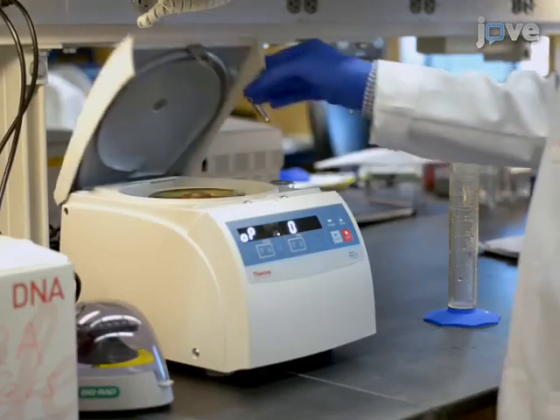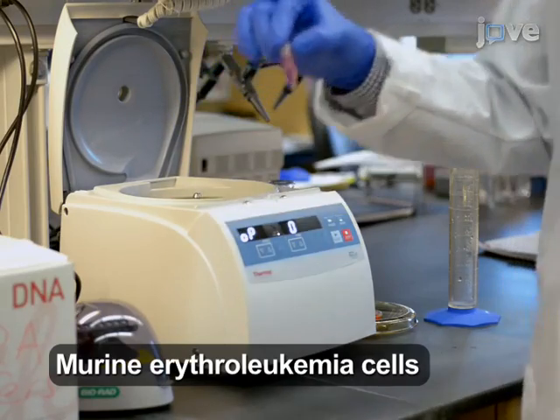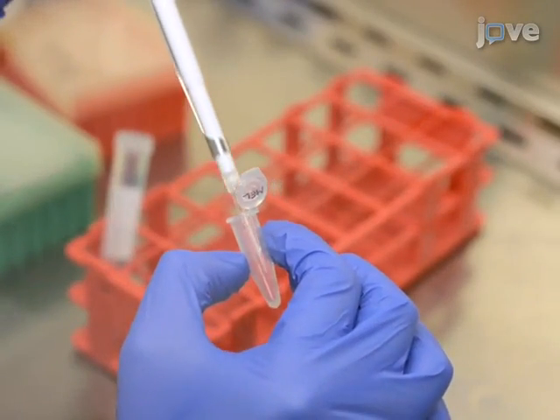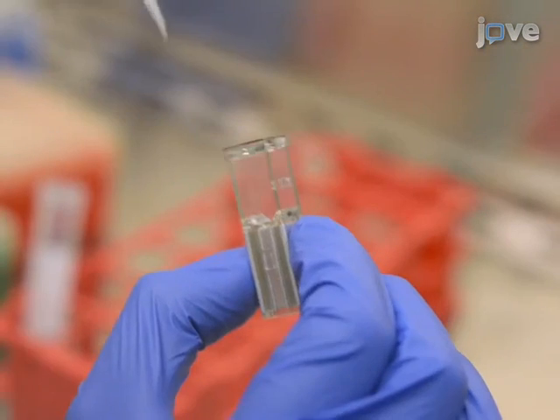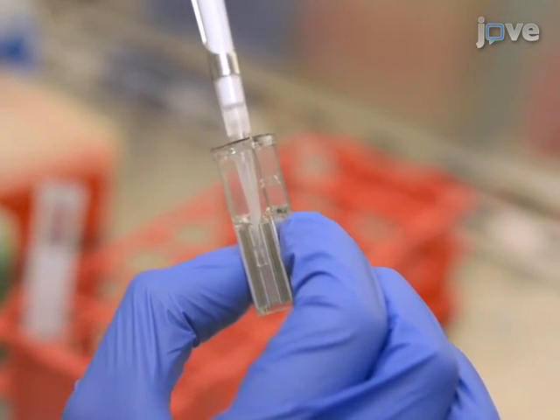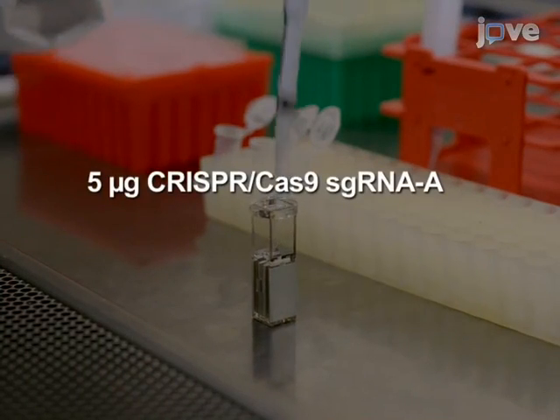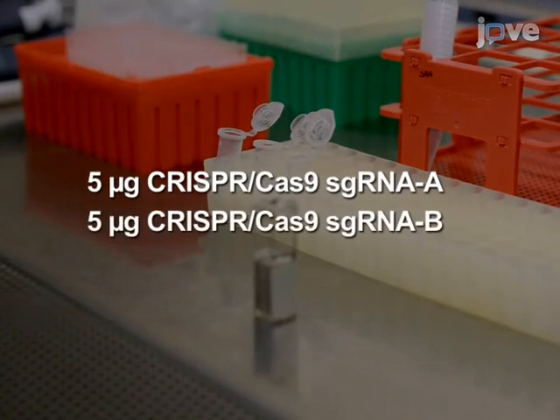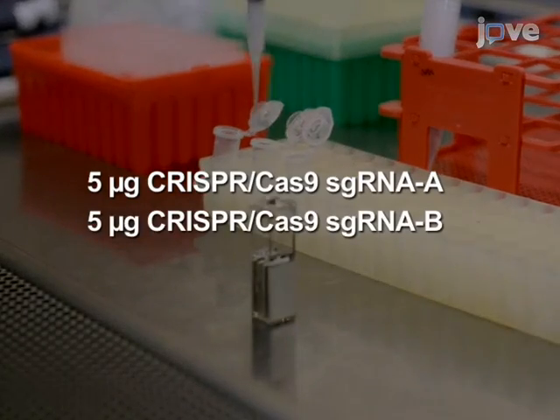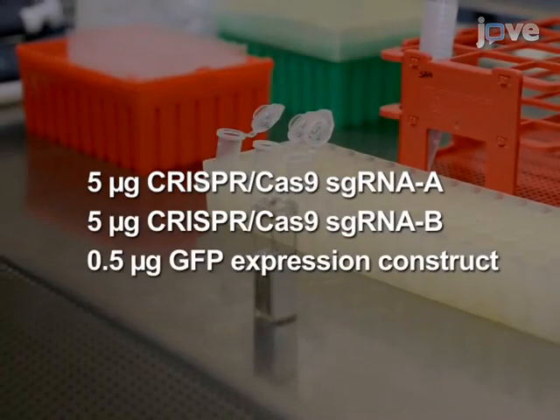For each CRISPR pair, pellet two times ten to the sixth cells grown in suspension. Resuspend the cells in 100 microliters of electroporation solution and then transfer to an electroporation cuvette. Add 5 micrograms of CRISPR-Cas9 construct sg-RNA-A, 5 micrograms of CRISPR-Cas9 construct sg-RNA-B, and 0.5 micrograms of the GFP expression construct.